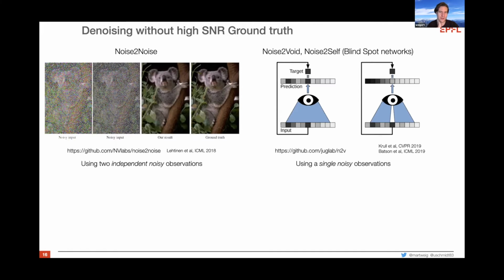I mean, if you can acquire clean ground truth anyhow, then it's relatively cheap to just acquire a super fast camera exposed image before, right? Okay. Yeah, I think the fixation was a special thing for the worm, which twitched so much that otherwise it wasn't possible. But in general, if you can do it all with live imaging, you should do that.